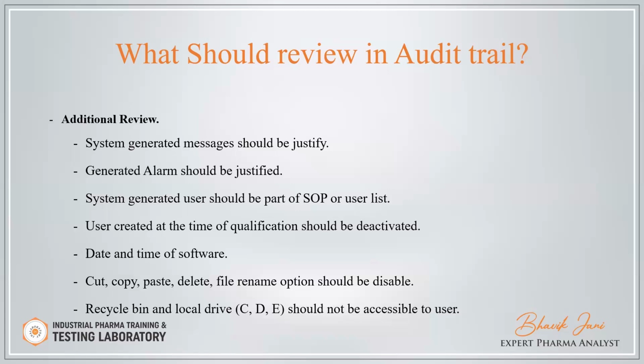User created at the time of the qualification should be deactivated. Many times during the computer system validation, the IT department creates the IQ user, OQ user, PQ user, like that as the username. But after the completion of the CSV, the IT department does not deactivate those users. So those users should be deactivated.